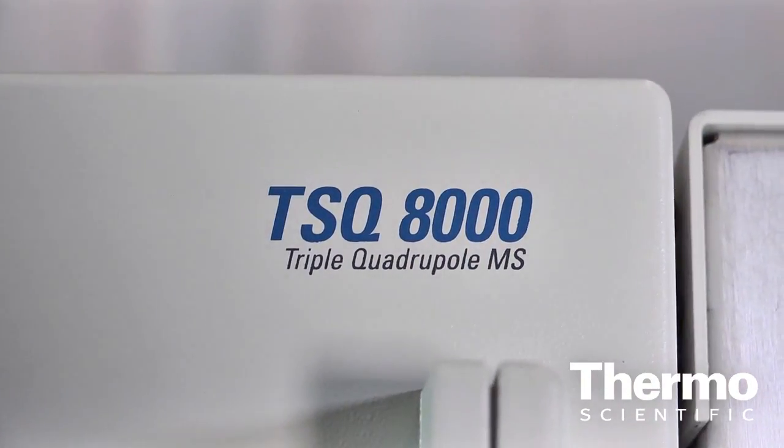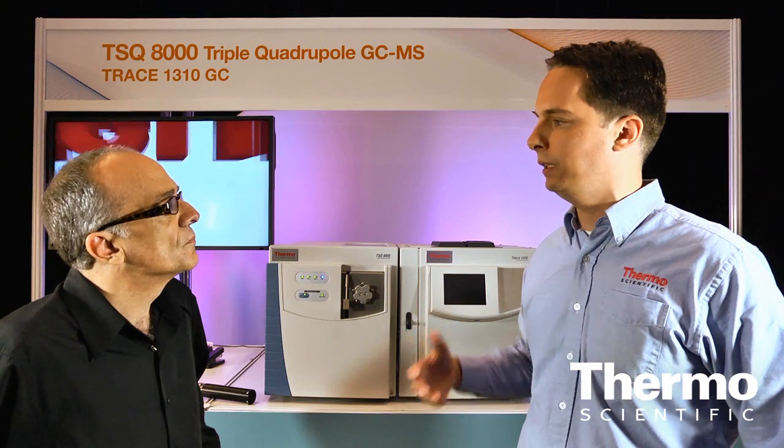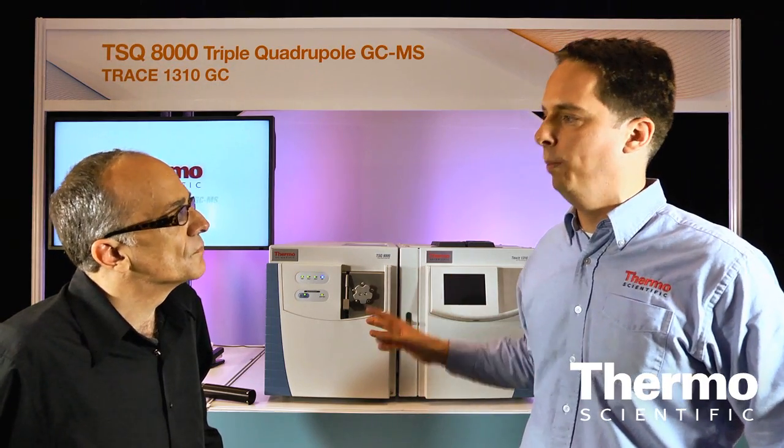We have features like a dual heated source, a repeller that will overcome ion burn when it forms, and also a patented RF lens that protects the ion guide and also the quadrupole — so it's a very robust source.